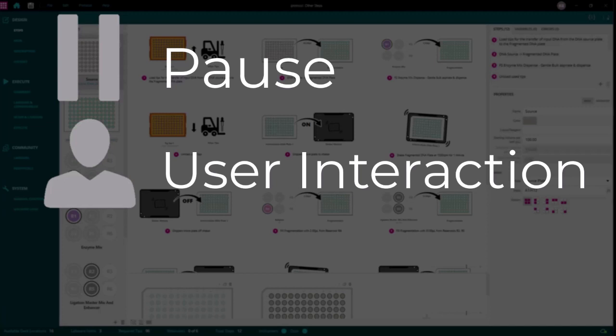User interaction. This pauses the protocol and requires intervention from the user. The Firefly will show a custom message to the user and will not recommence the protocol until the user interaction is completed. It does not have a set duration.